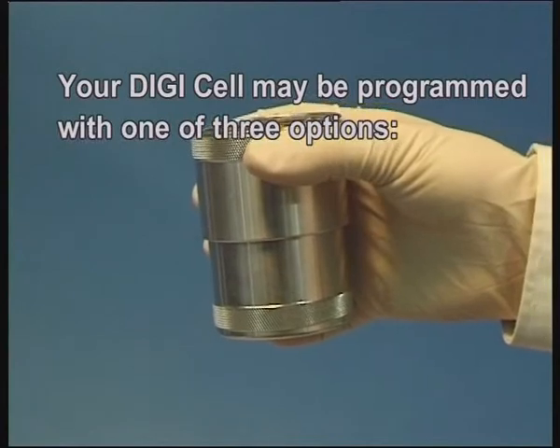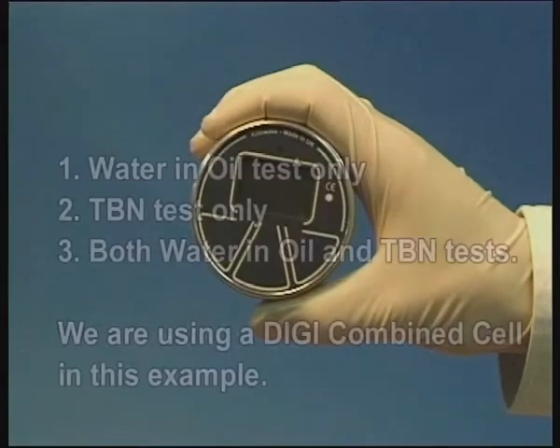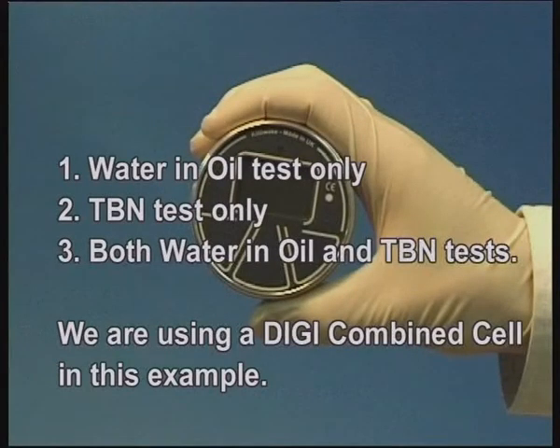Your DigiCell may be one of three options: water in oil test only, TBN test only, or both water in oil and TBN tests. We are using a DigiCombine cell in this example.